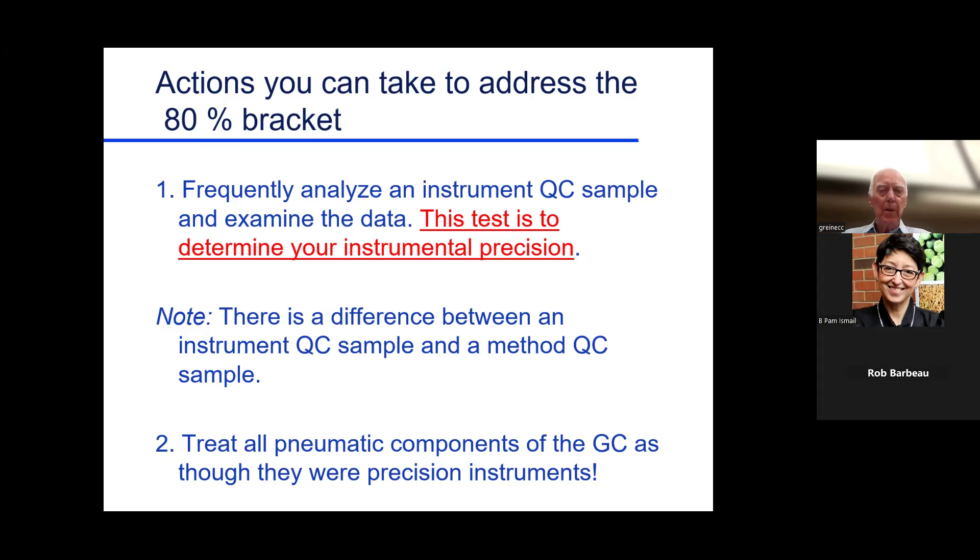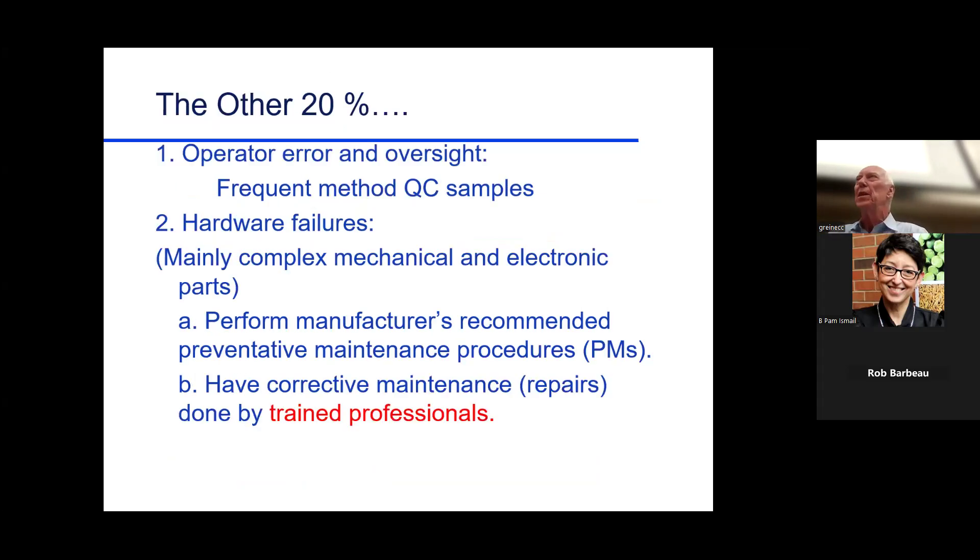The pneumatic components of the GC, flow controllers, gas sources, are precision instruments. You can buy some of the equipment from the local hardware store. You can go to your gas supplier and pick up regulators, piping, tubing. You don't do it. You pay the money that they want for these pieces of equipment because they are precision made. They may look like something at the welding shop, but they're not. They contaminate your carrier gas, your mobile phase, and you end up with peaks you didn't really expect. Very important.